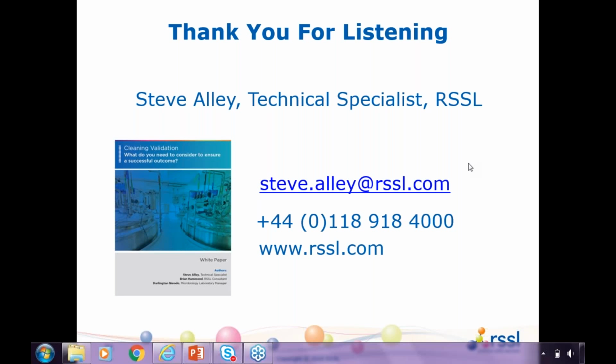Perfect, thanks, Steve. One of the other questions we've had come through was, what approach should be taken if low recoveries are obtained during the recovery experiments? Quite an open question. There's lots of scenarios we can look at here, and I think recoveries in general in cleaning validation have a process of using correction factors.